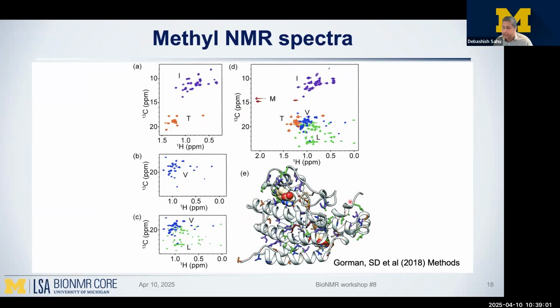Again, this 30 is again a small number, but this particular protein doesn't stay as a monomer. It stays as a dimer, okay, homodimer. So in NMR, you don't see two different signals corresponding to two different domains. That is a homodimer. You only see one set of signal. That means that they have the same structure, but they form this homodimer, which we have confirmed using other biophysical techniques.